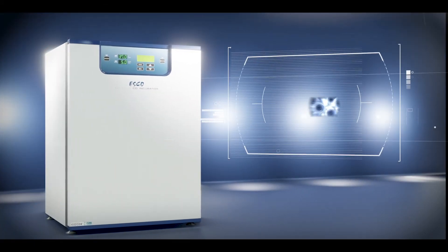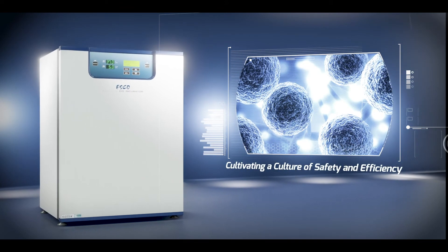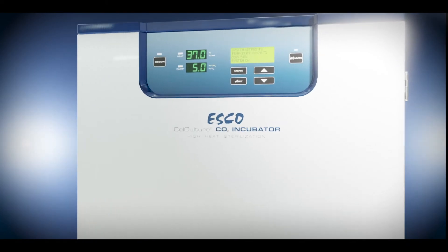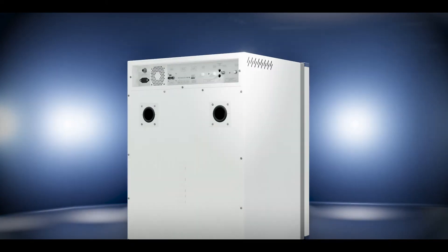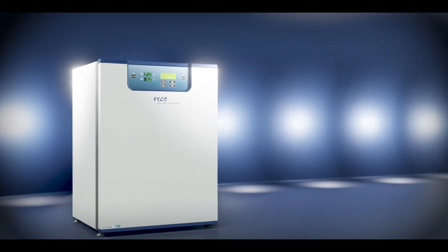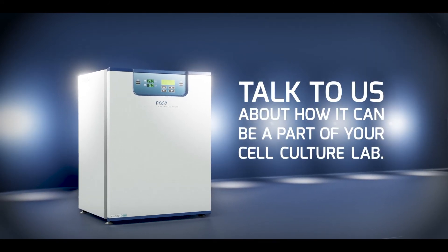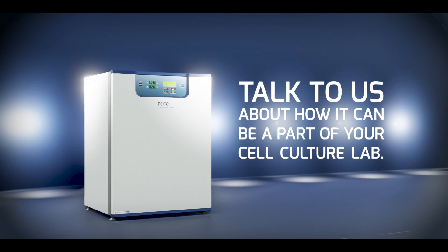With all these outstanding features, you can now cultivate a culture of safety and efficiency with the Cellculture CO2 Incubator with 180 degrees Celsius High Heat Sterilization. Talk to us about how it can be a part of your cell culture lab.